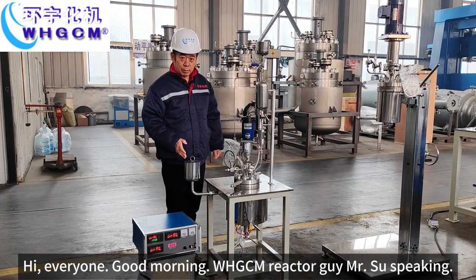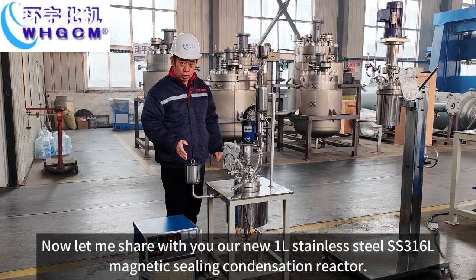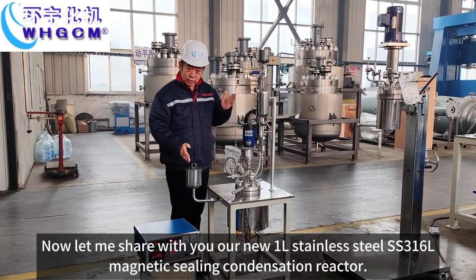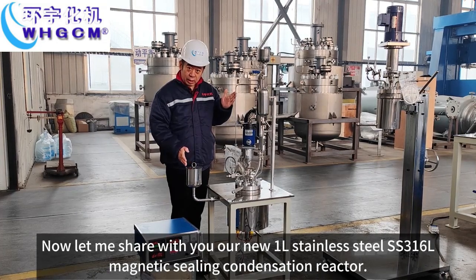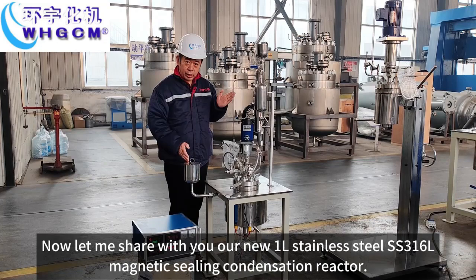Hi everyone, good morning. WHGCM reactor guy Mr. Su speaking. Now let me share with you our new 1L stainless steel SS316L magnetic sealing condensation reactor.